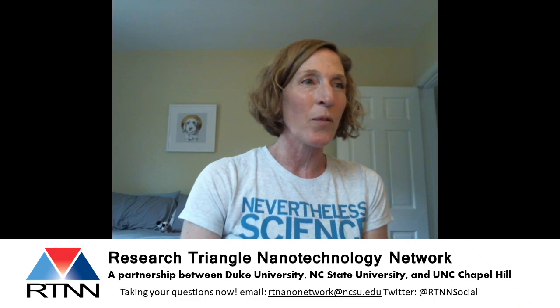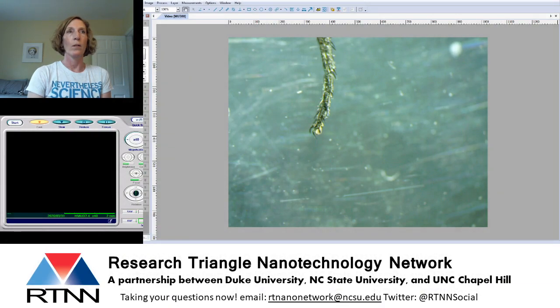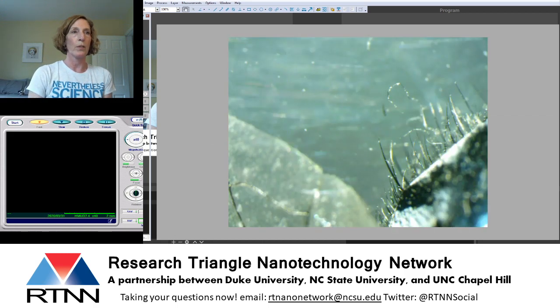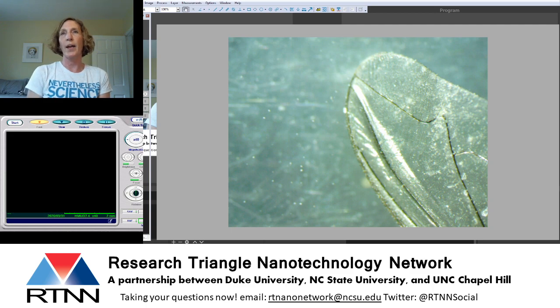So let me switch over to our light microscope view. There we go. And we need to turn our light on. Oops, I bonked it. There we go. Let me move us to the wing. I thought I had left it here, but I forgot. Okay, so we're going to start with the wing of the fly.